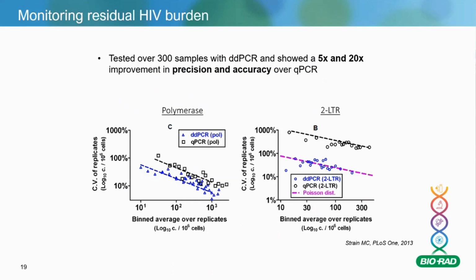You can see here in the slide, this proviral HIV DNA, the POL gene, was used to measure cellular viral reservoir size, and long terminal repeats for viral dynamics. Both assays showed a significant increase in performance when used in a digital PCR format, and endpoint ddPCR was much more sensitive in detection of the mutants. In this example, I think, yes, over 300 clinical samples were used in the study.